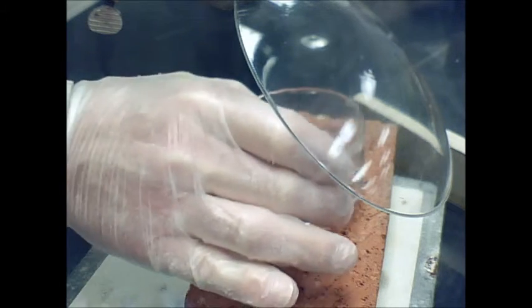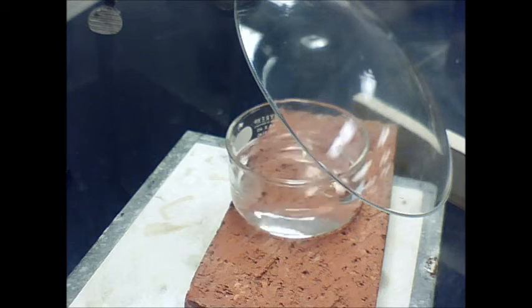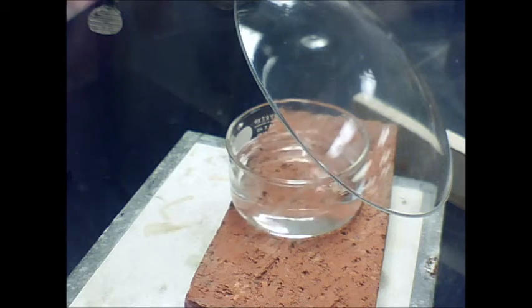And pouring that out in the drain with lots of water. And I'm getting some more water. And let's take a look at what happens when we react another metal. This time potassium.